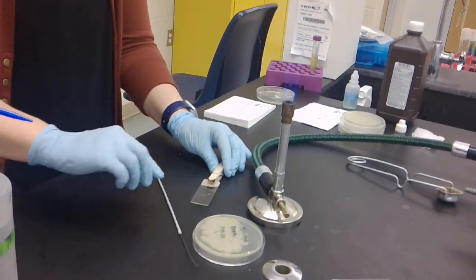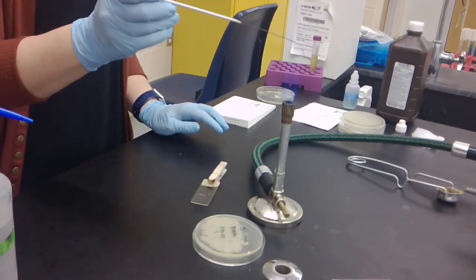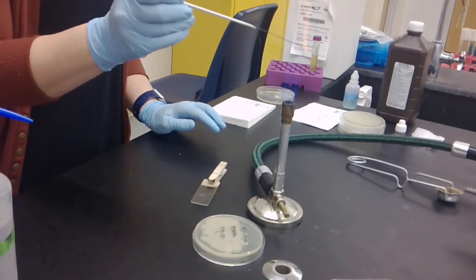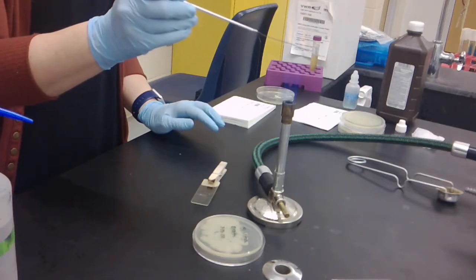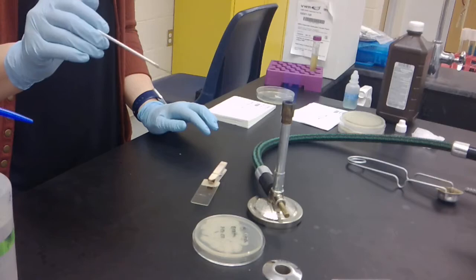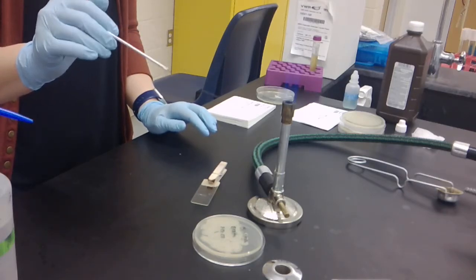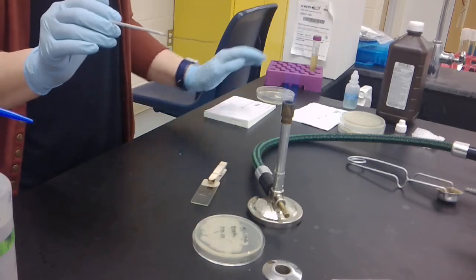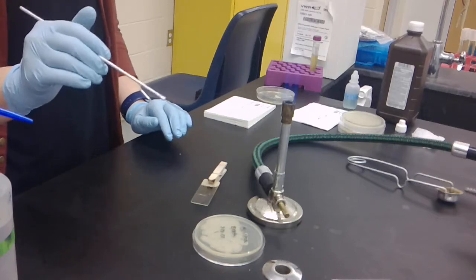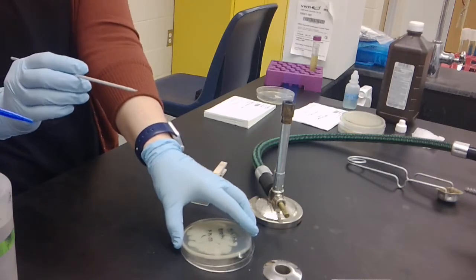You can then sit your slide down and aseptically transfer bacteria from a plate onto your slide. Remember, to do this, you have to incinerate your loop and allow it to cool before transferring bacteria. If you are heat fixing bacteria from a broth culture, you do everything the same except you omit the water. Because the bacteria is already in a liquid suspension, it's not necessary to add water to the slide before heat fixing bacteria from a broth.